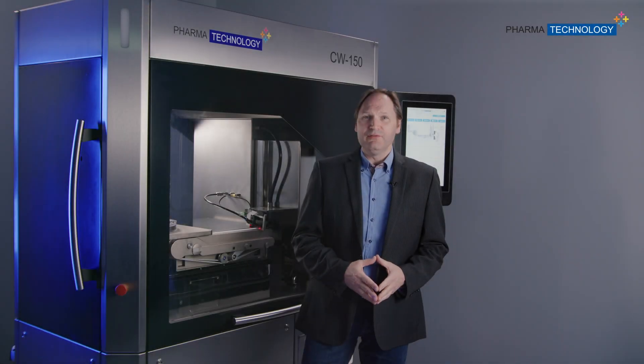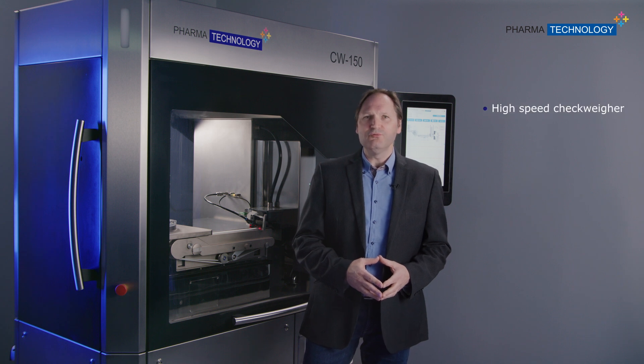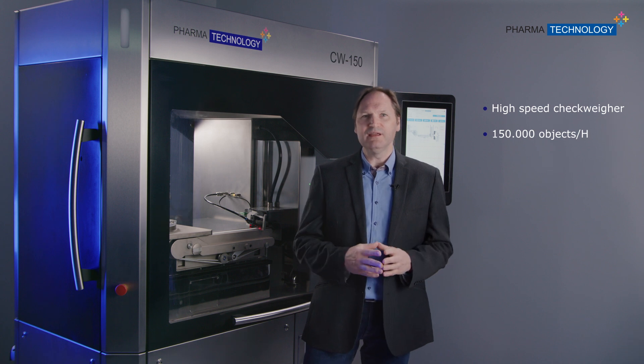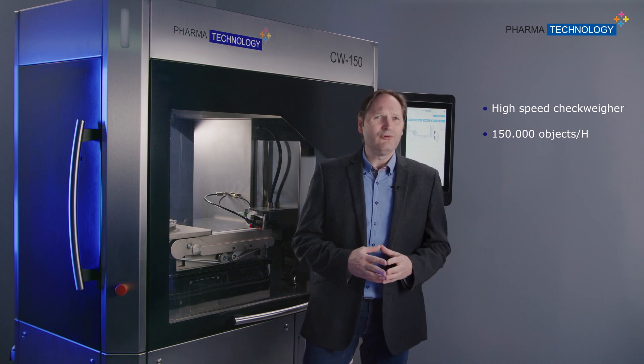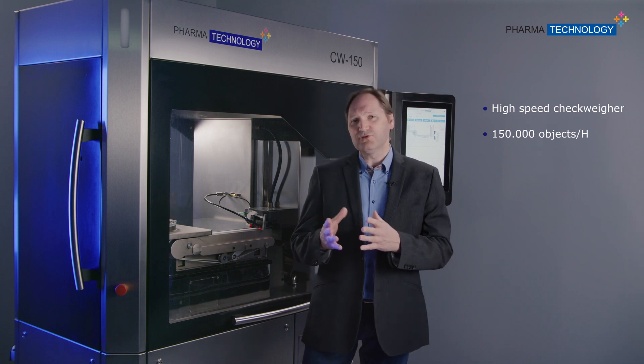The CW150 machine is a new generation of high-speed checkweighers, able to run up to 150,000 capsules or tablets per hour on one single lane. It's an ideal tool for production quality control, improving batch quality by weighing 100% of your production.